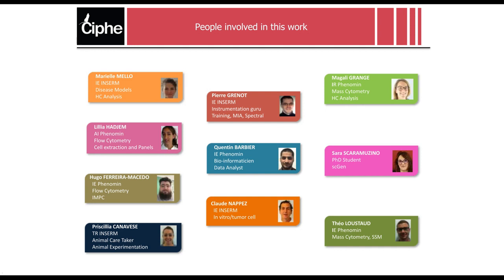But our partners are experts in the biology. They already did preliminary experiments, and they need to share the data with us, which is the foundation of the collaborative work we undertake. So using Cytobank to ask people to share their historical data sets on it is really important.